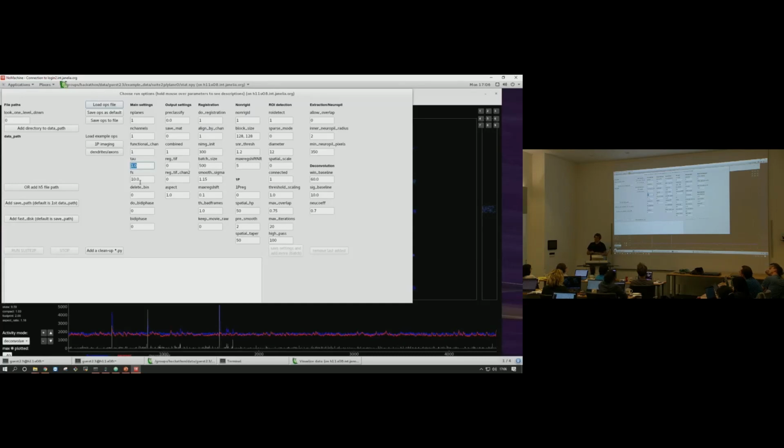Even in cortex, if you're recording interneurons, different interneurons have different calcium buffering dynamics. You probably already know a lot more than me about that if you're studying those cell types, so you probably know if you should want to make the time scale longer or shorter based on that. If you're studying interneurons that have high firing rates, not very clearly defined transients, you might want to skip the convolution altogether because it's even more worrying there.